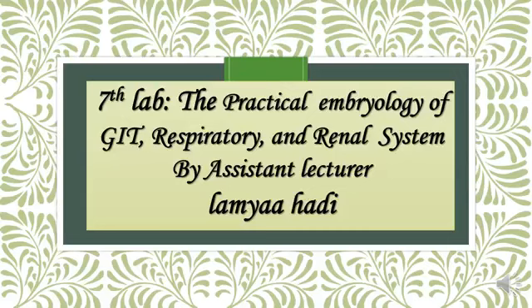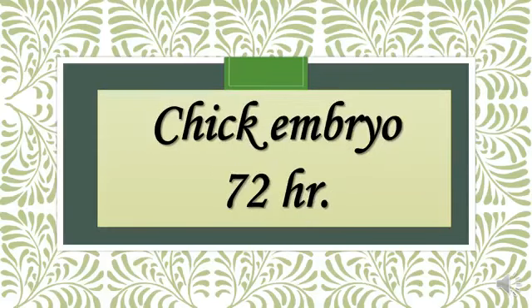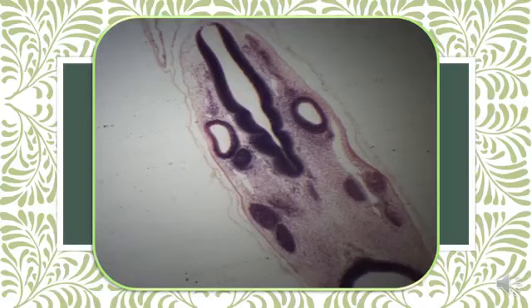Our lab today, I talk about the practical embryology of the GIT, respiratory and renal system. First slide, transverse sections in the chick embryo, 72 hours. These sections show transverse sections in the chick embryo.